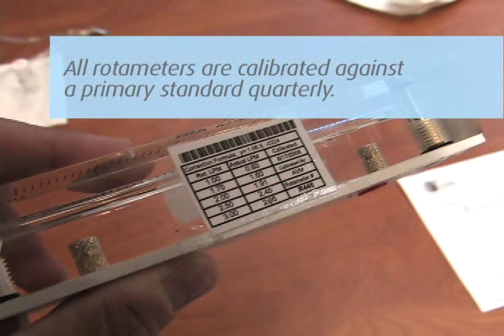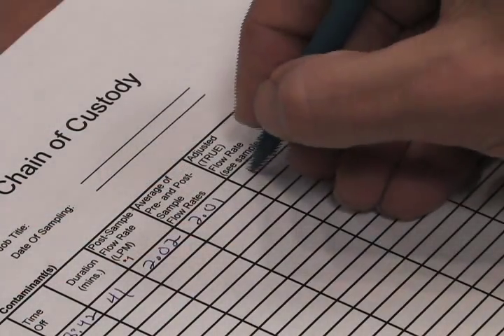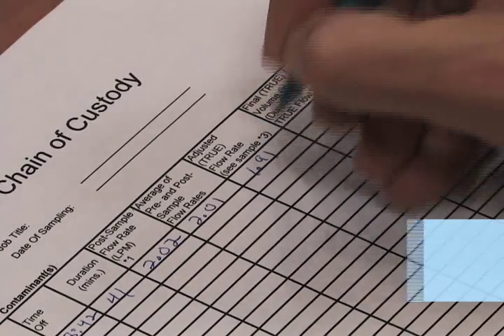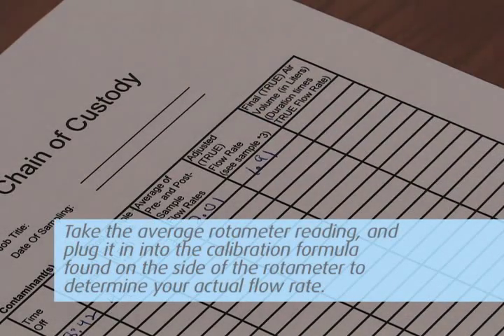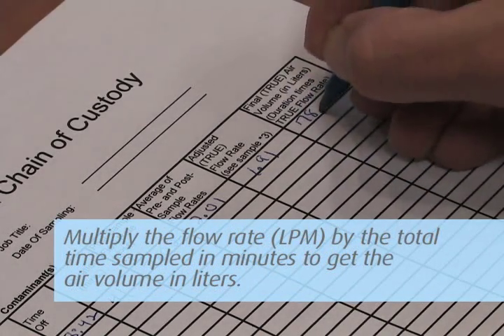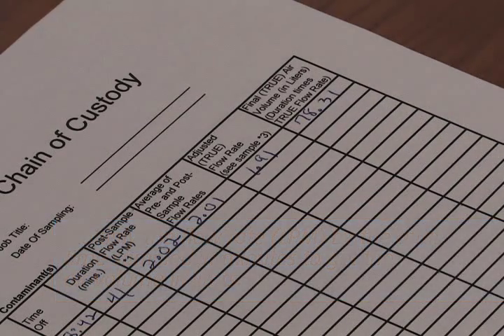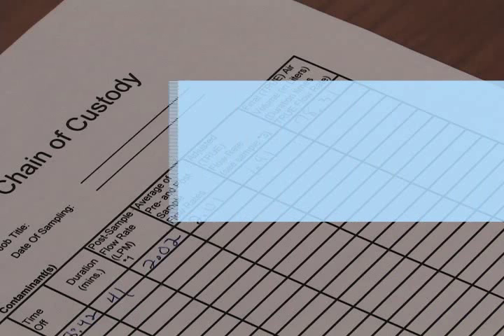All rotometers are calibrated against a primary standard quarterly. This calibration formula is located on the side of the rotometer. Take the average rotometer reading and plug it into the calibration formula where the X is to determine your actual flow rate. Multiply the flow rate in LPM by the total time sampled in minutes to get the air volume in liters. Record the total liters on the field pump data sheets and the chain of custody.